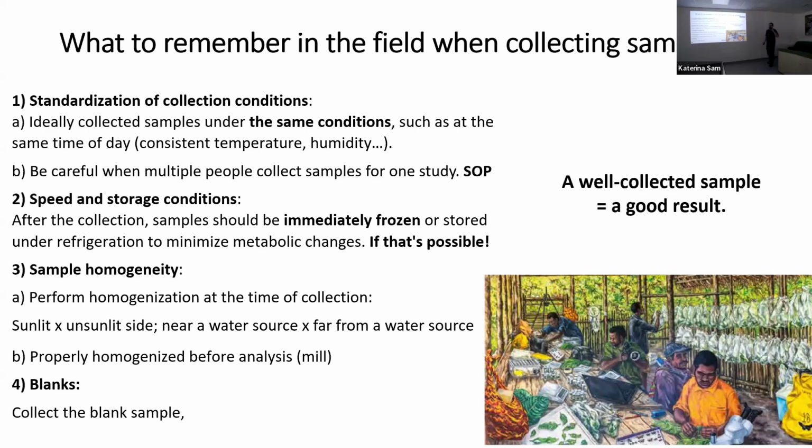But the enzymatic activity is still working in the sample, and it depends on what you want and what you need. If you need the information exactly about this time point when I harvest the leaf, you must stop the enzymatic activity. Typically, we use organic solvents or liquid nitrogen.